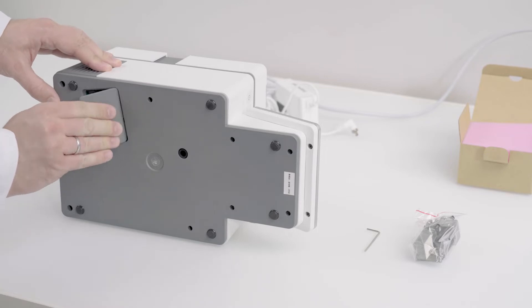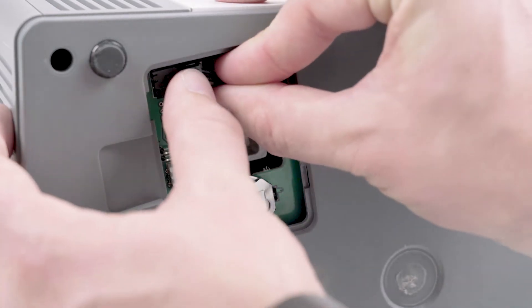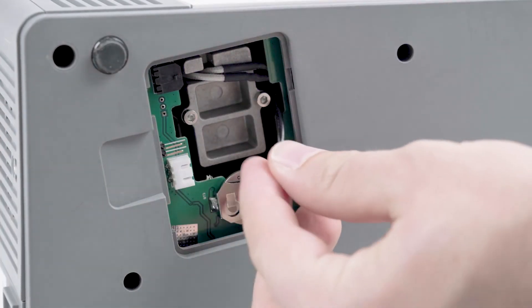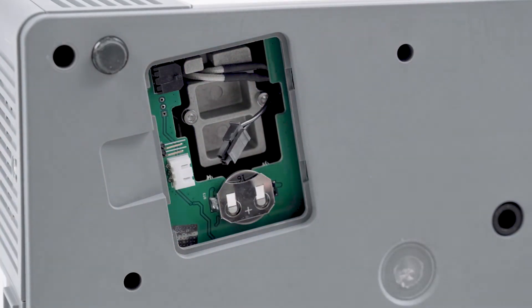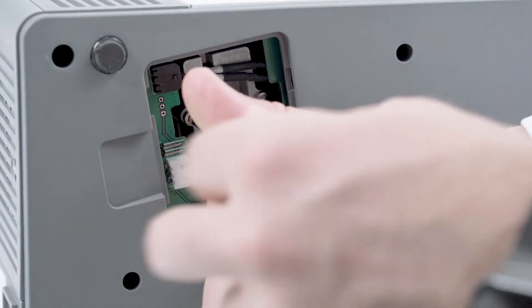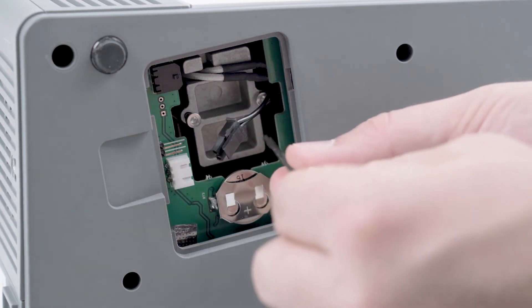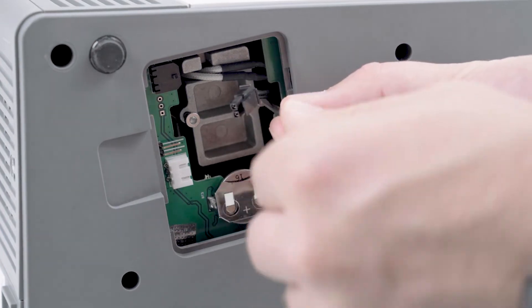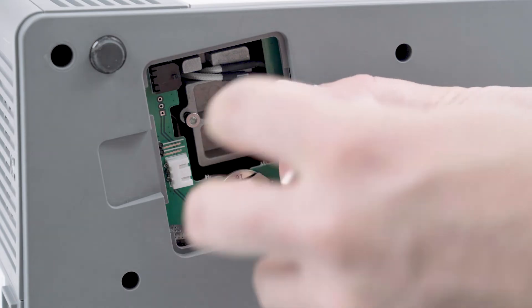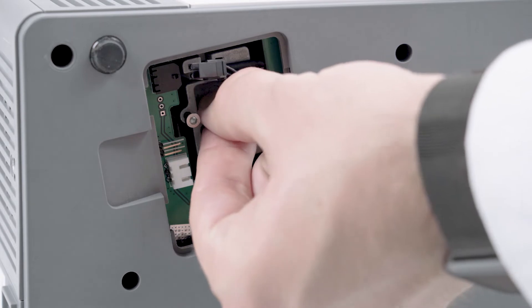Open the cover. Disconnect the cable by pressing down the latch and pulling the plug out of the socket. Unscrew the two screws with the allen wrench. Pull out the lamp module.